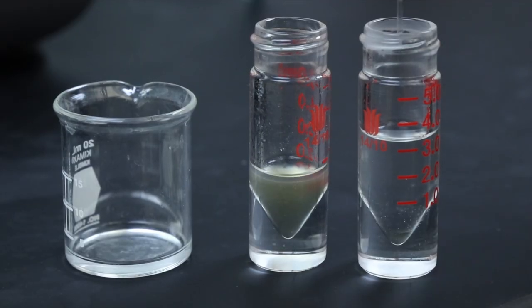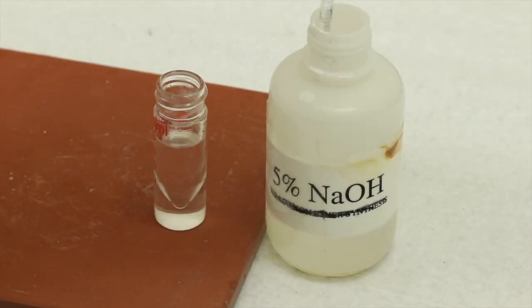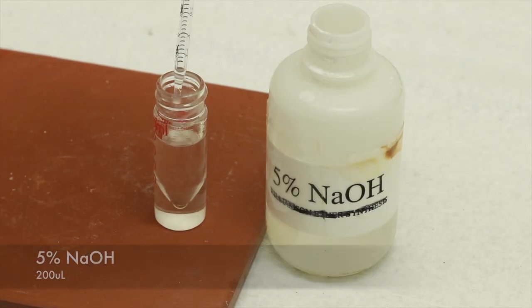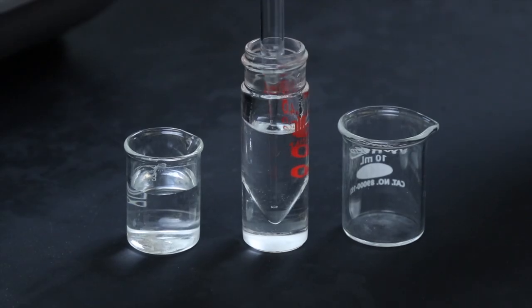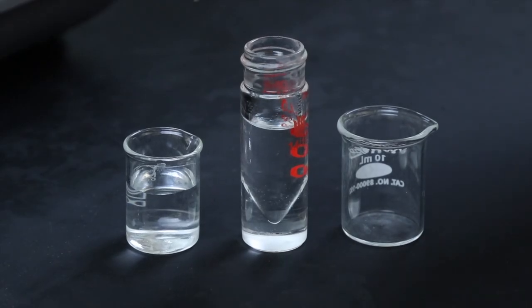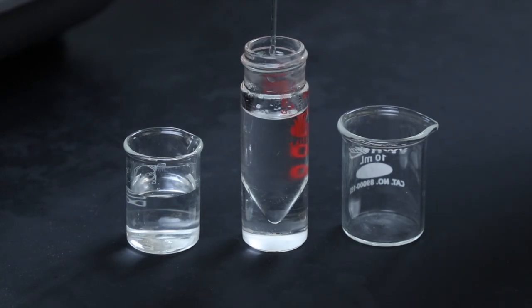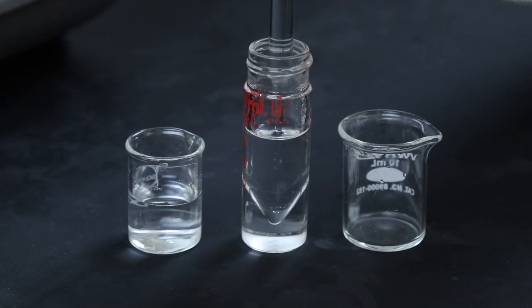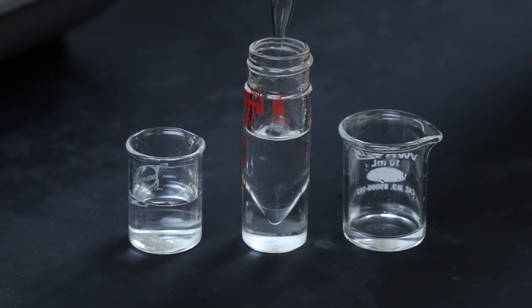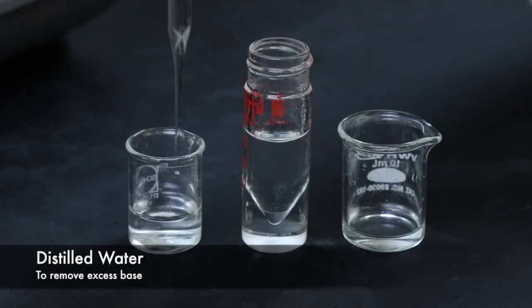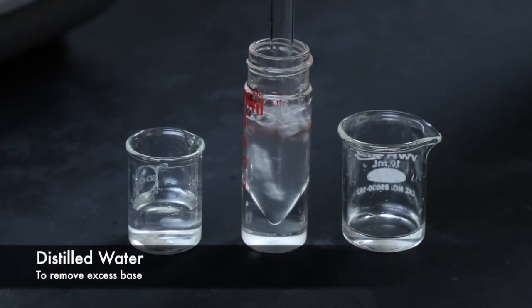Once the extractions are completed, I'll rinse the extracts with some sodium hydroxide to help remove any unreacted phenol that might be left over, and I'll mix those two layers together really well to allow the base to interact with everything, and then I added a little bit of distilled water just to distinguish the two phases a little bit better. Then I can remove the basic phase, and rinse the organic extracts with a little bit more distilled water to remove any excess base that might have been left over.